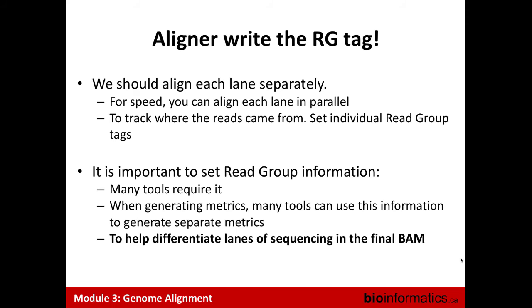I thought the lane number was embedded in the FASTQ file. In the read name, yes, but if you have the same run numbers with different lanes, you won't be able to retrieve it.